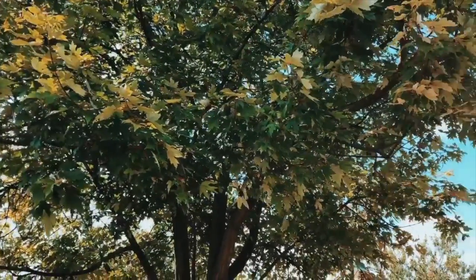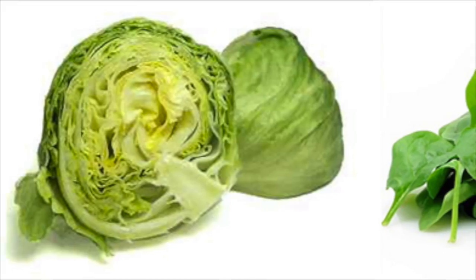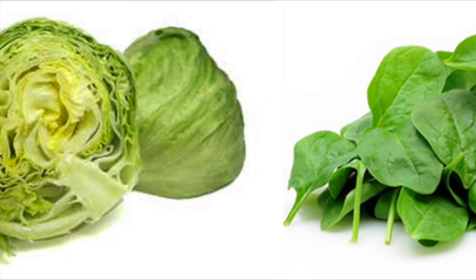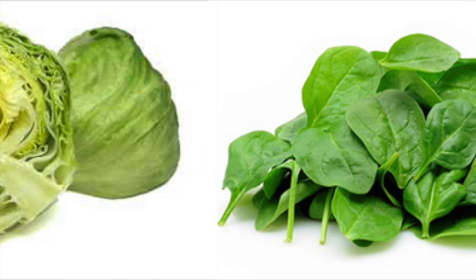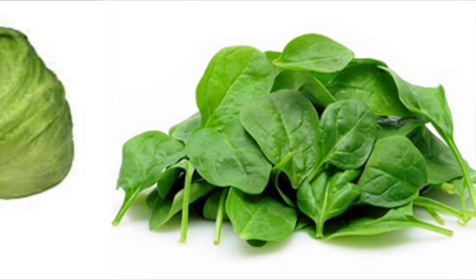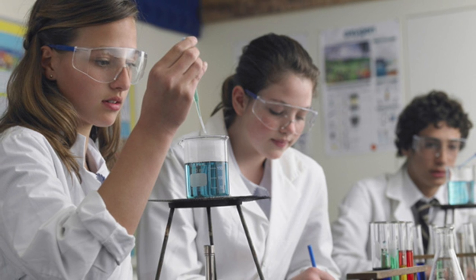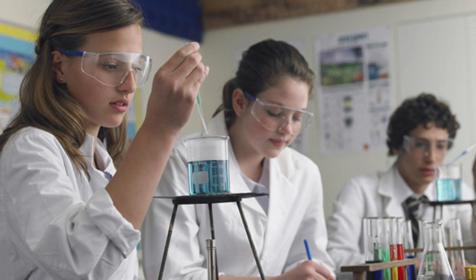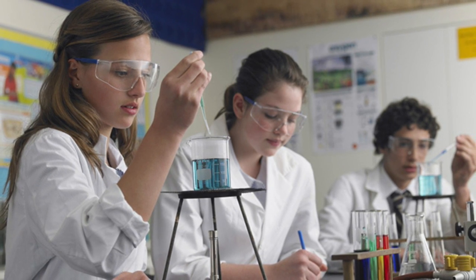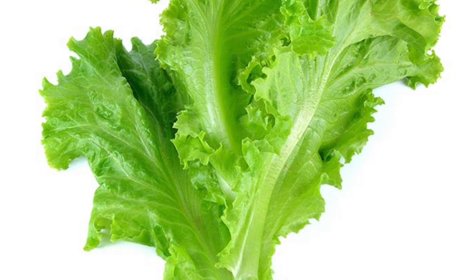In our experiment, it was hypothesized that if both spinach and lettuce leaf discs are placed in a bicarbonate solution, then the spinach leaf discs will float more. This hypothesis was validated in the lab, and by looking at the data, the gradual increase of the floating spinach discs as time elapses can be seen. This, however, did not apply to the lettuce discs.